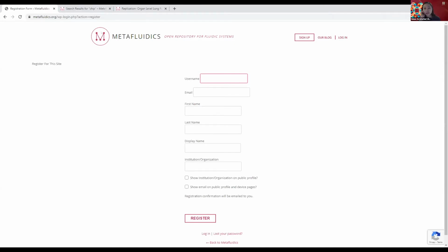I'm a big fan of serpentine channels personally. I just think they look very pretty, especially if you view them under the microscope. It's just curves all around. And Janice, I think you mentioned yesterday you liked Christmas tree gradients a lot. Oh yeah, it's the epitome of mixing channels. You just throw all the serpentine channels together, and especially if you're just playing around with colors, then you have this beautiful gradient of colors coming out of it.